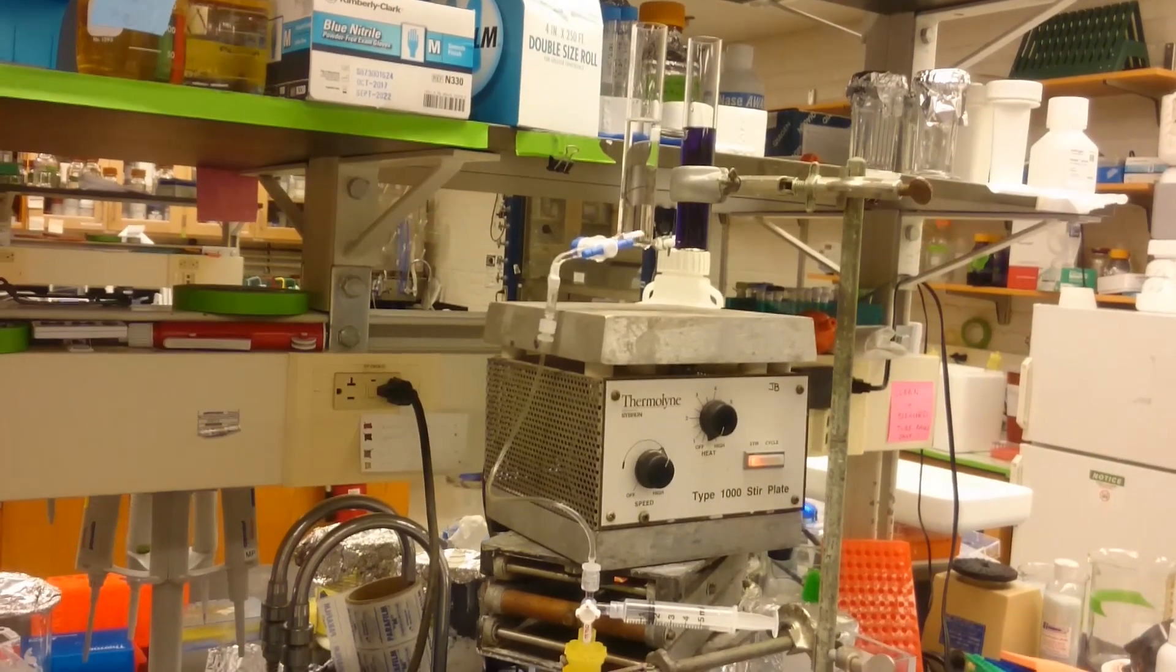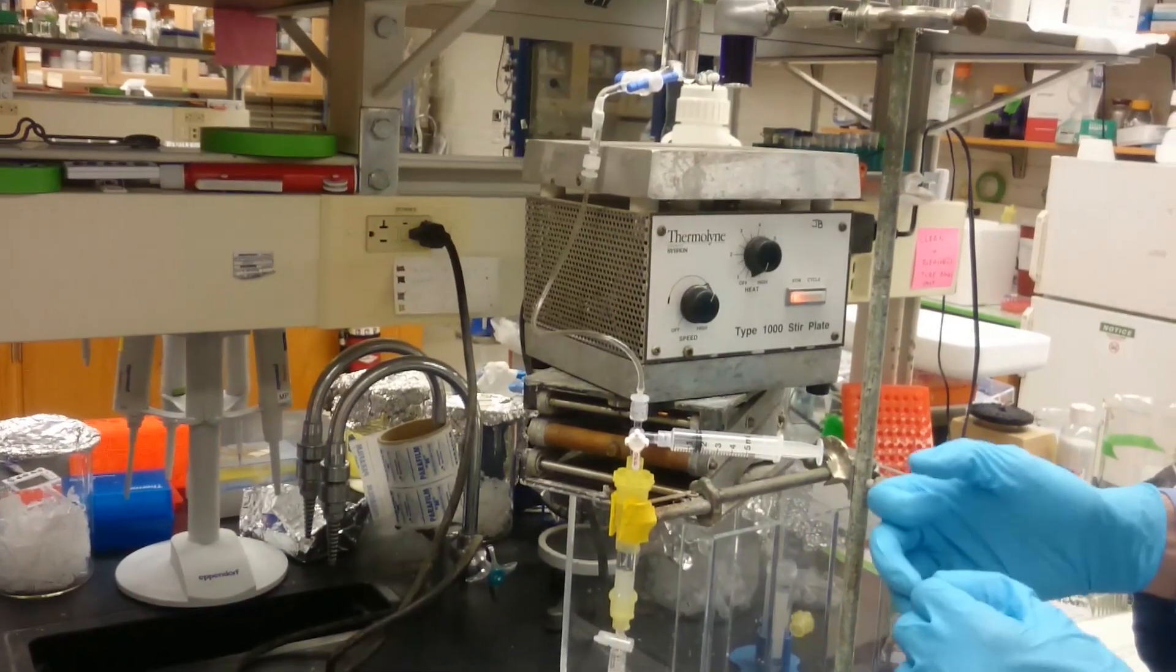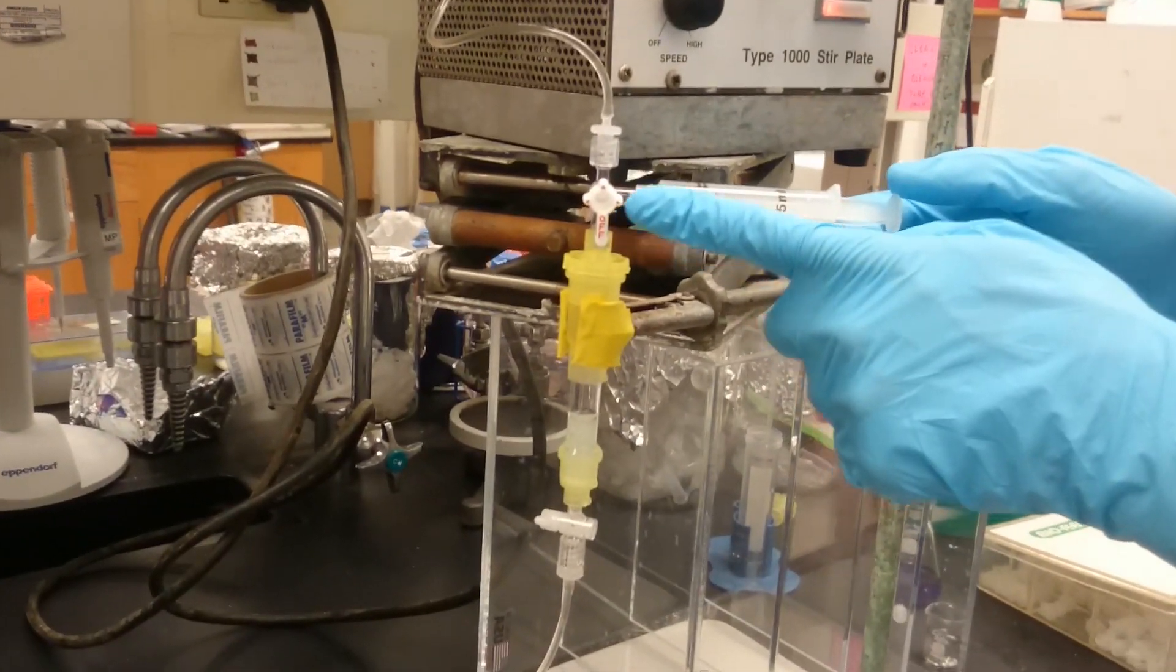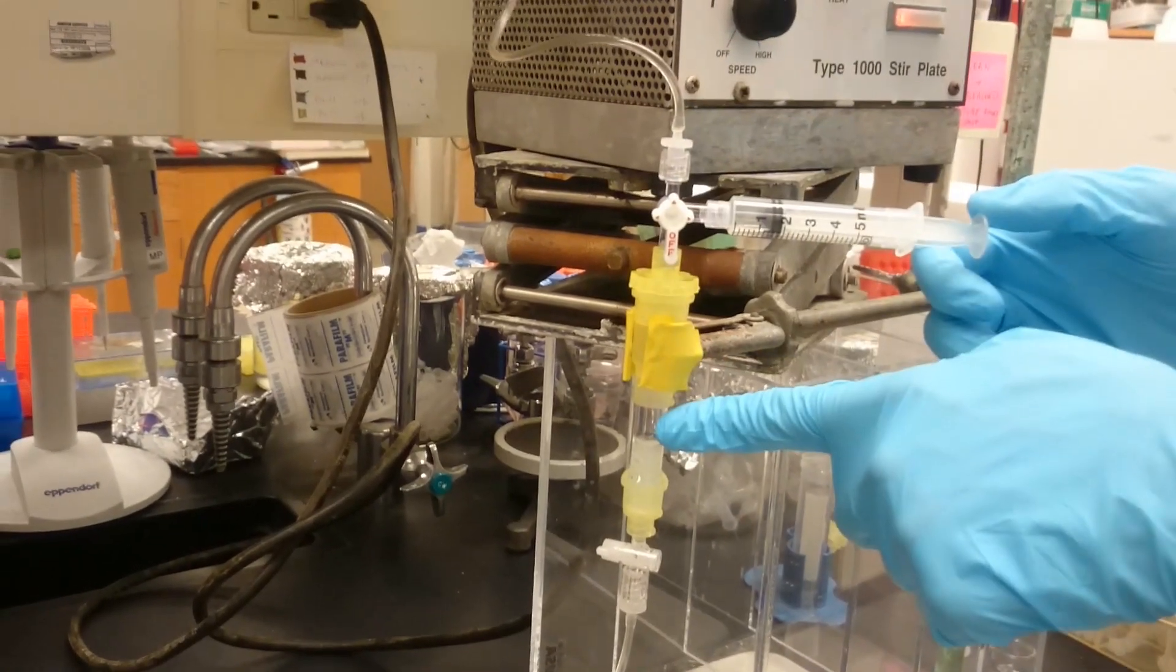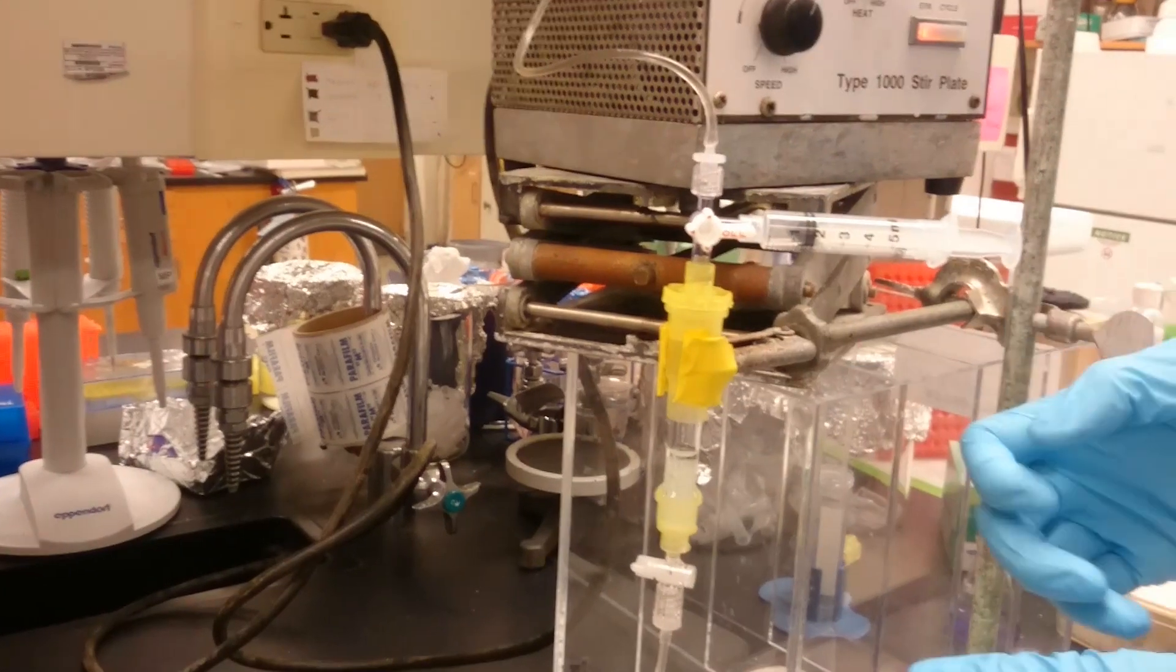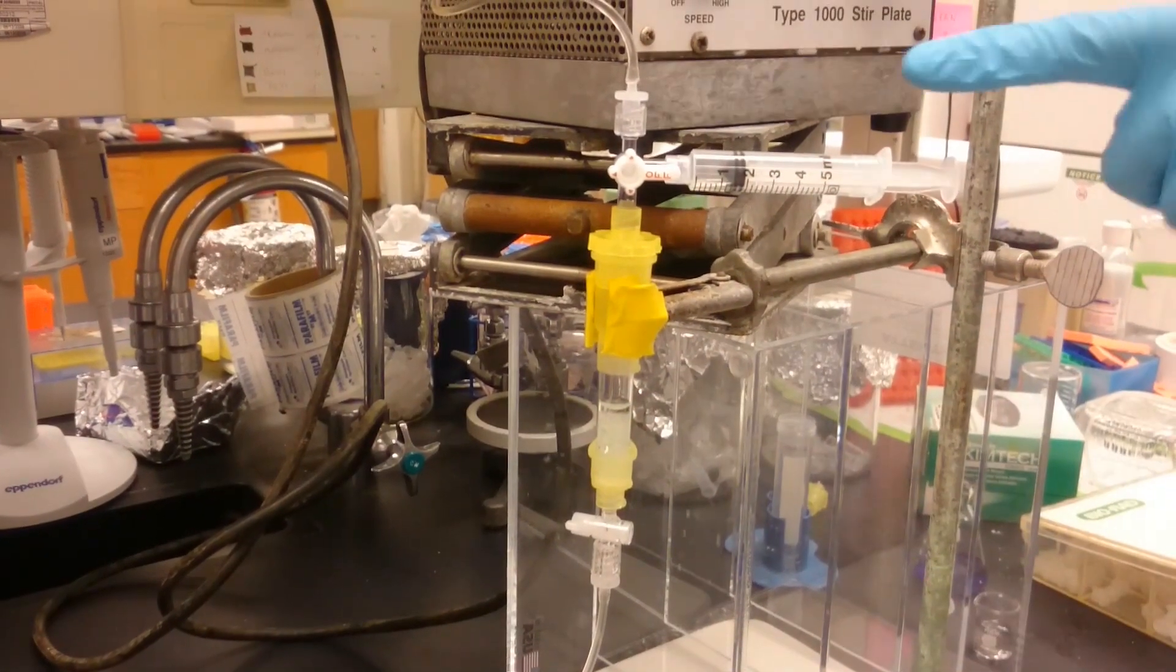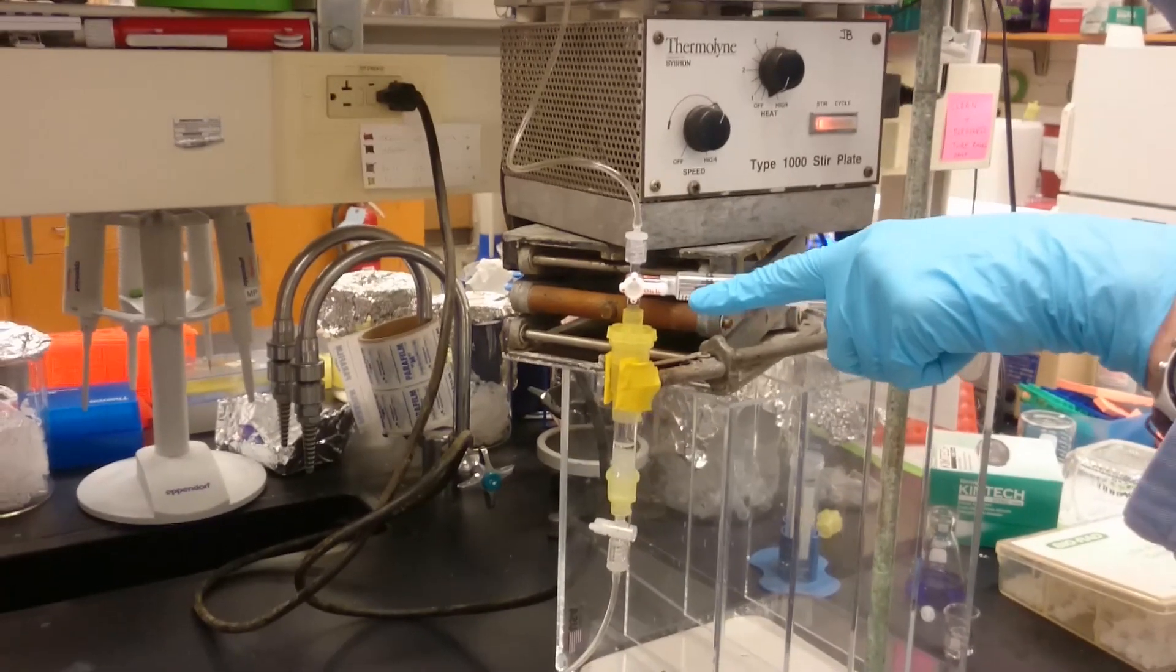So then we can close off the three-way valve to the syringe, and that'll make it open from the buffer to the column like this. And then you can see that it's starting to fill here up to the depth that is determined by the vertical separation between the column and the buffer reservoir.